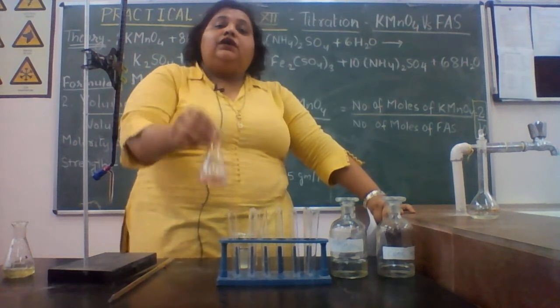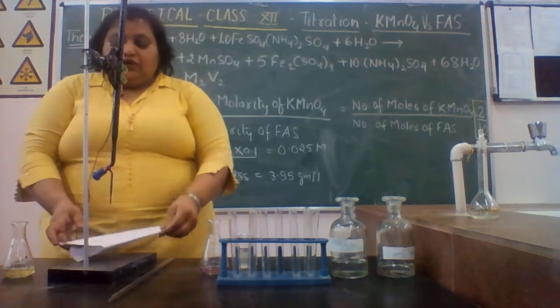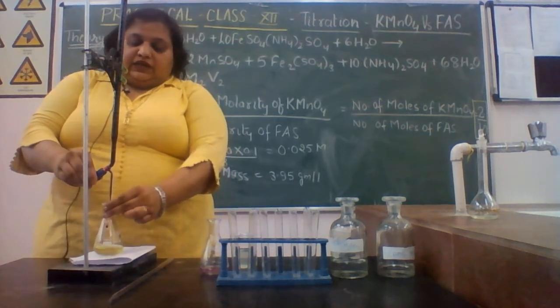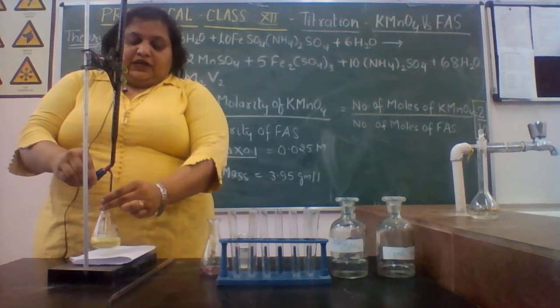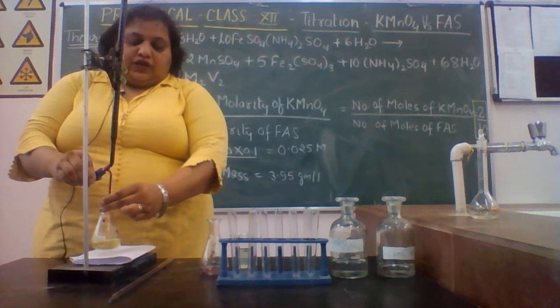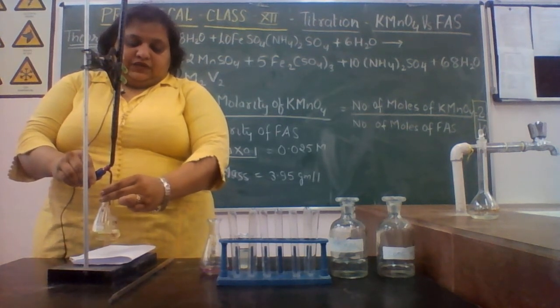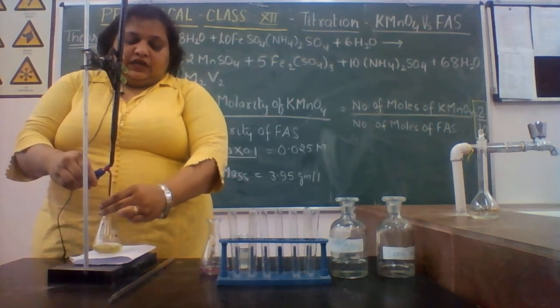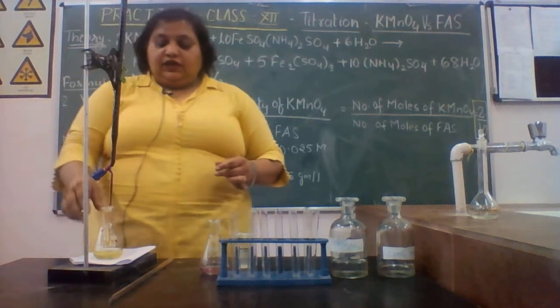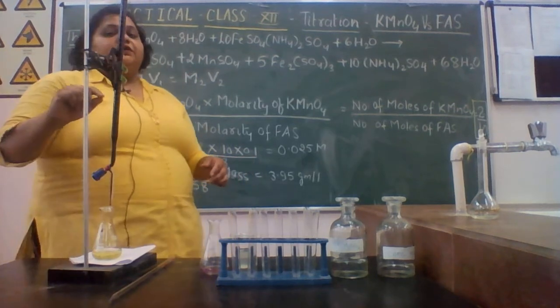It should not decolorize. As you add the KMnO4, at the beginning the KMnO4 will turn the solution pink, but it will decolorize, right. But at the end point it will remain pink even after a long time. It should be the permanent pink color, and from this burette you have to find out the reading, what volume you have used during your experiment, right.